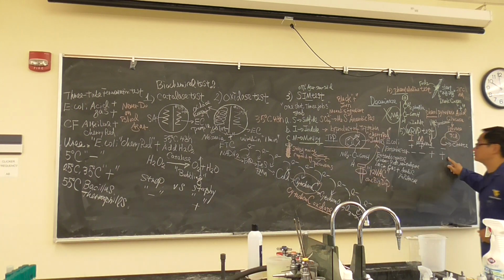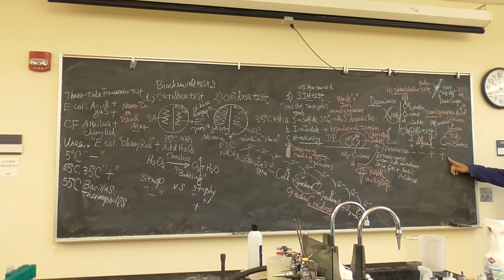Do you think it's funny? It looks like positive, positive, negative, negative, negative, negative, positive, positive, like the sticky ends of a DNA sequence. That's why this test is important. So you may feel you'll have a little trouble on the final exam, is that right? Because of a bunch of these things.